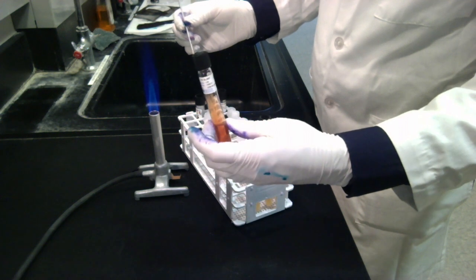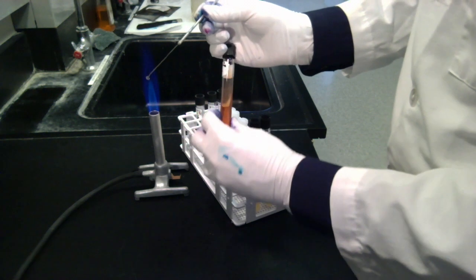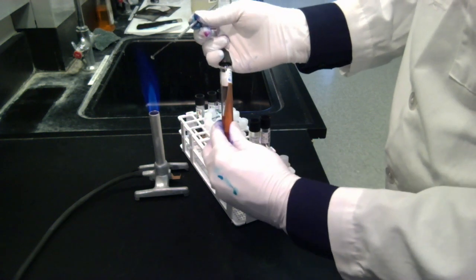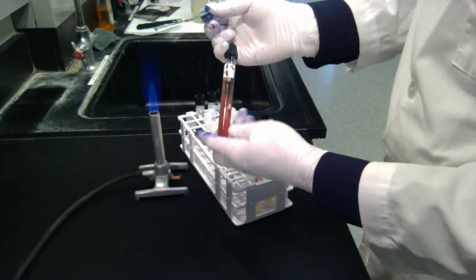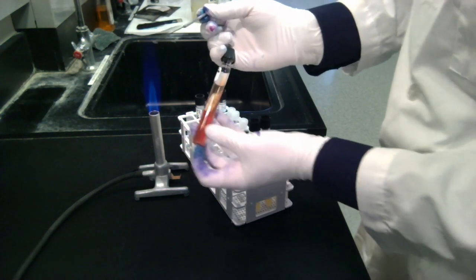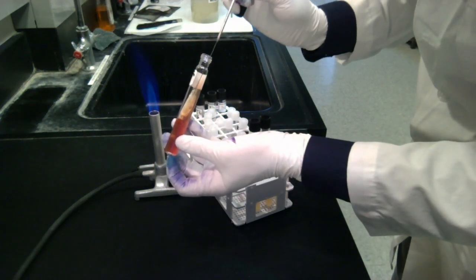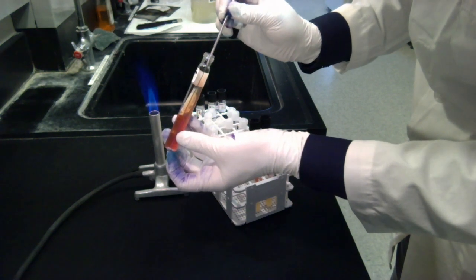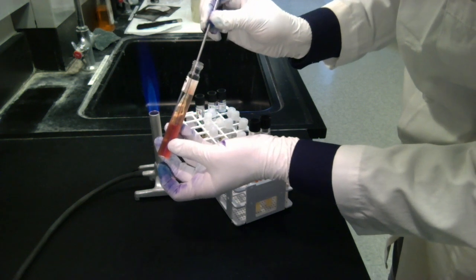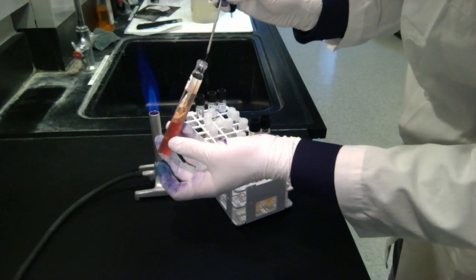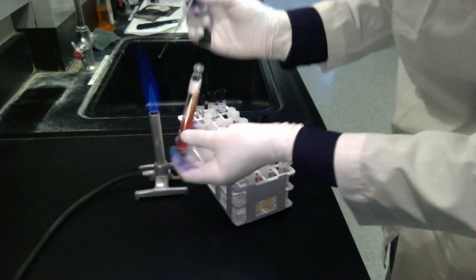I'm going to start with my triple sugar iron agar. So the idea with this is I'm going to stab all the way down first. And as I come out, I'm going to swipe it along the slant. So I go down, try to go down without touching the sides. Pierce the agar and go all the way to the bottom. Come up along the same line. And then drag it along the slanted portion. Then come out without touching the side. Close it up.